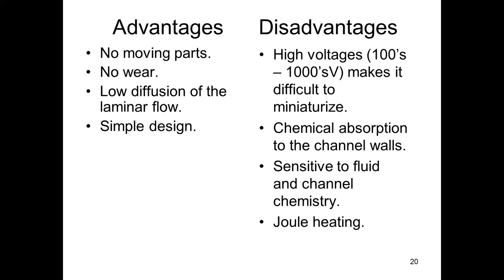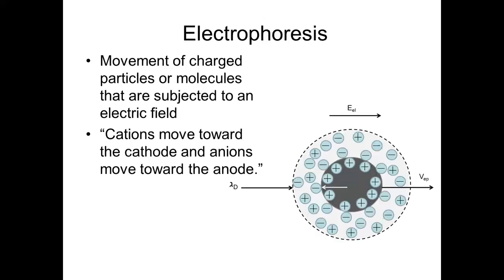Probably one of the largest issues is the heating. Resistive heating of the fluid: if we have fluids like, for example, blood, and we heat it up to a higher temperature, it's actually going to coagulate. Or an egg: if we have a raw egg and we put heat across it, it turns into a cooked egg. So that joule heating could be an issue, and it certainly could have ramifications on our tests. So this is used in areas where we could withstand that particular potential.